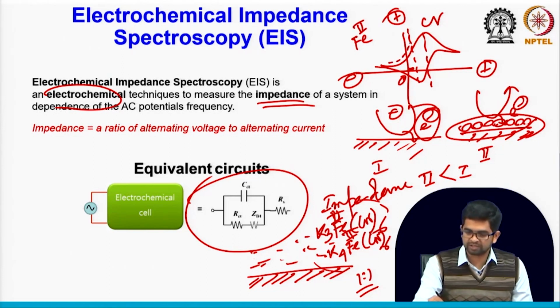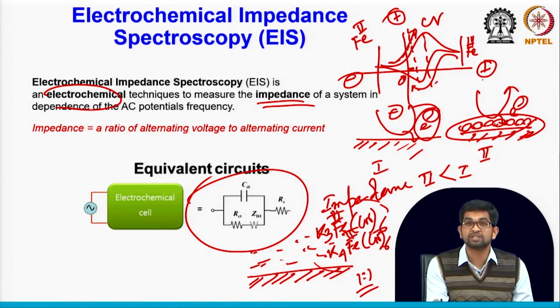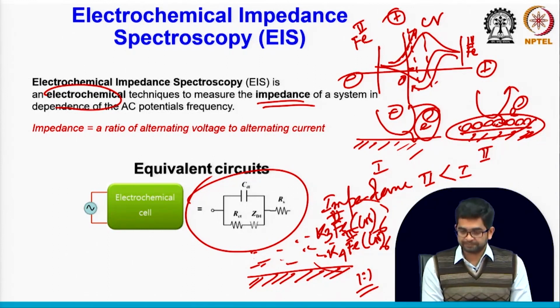So, it will oxidize, right. Then here we can stop. Then from here, it is the oxidation, and the back side of the CV is the reduction. So, here iron 3 starts to be reduced to Fe2, right. Like this way we can stop here. So, this is your potential window for your ferroferricyanide mixture, right.